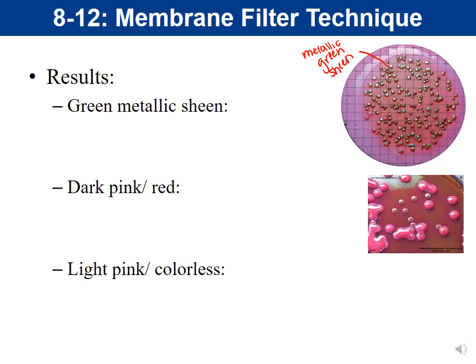It's important that when you look at these, you look at the nitrocellulose itself. So look at the bacterial colonies on the filter and not on the agar that surrounds it. Sometimes the agar around it has this metallic green sheen, but we're actually looking for the colonies on the nitrocellulose, because that's where the water sample passed. And so we're looking for bacteria on that filter.